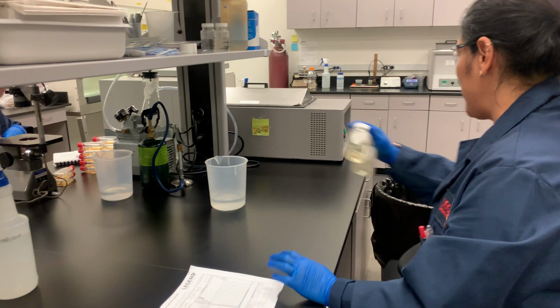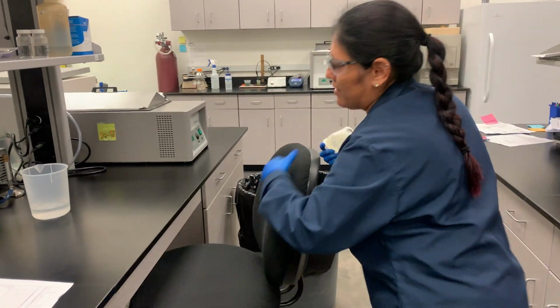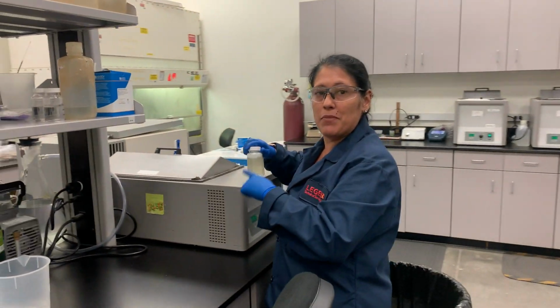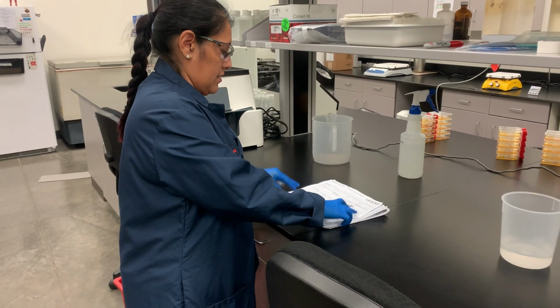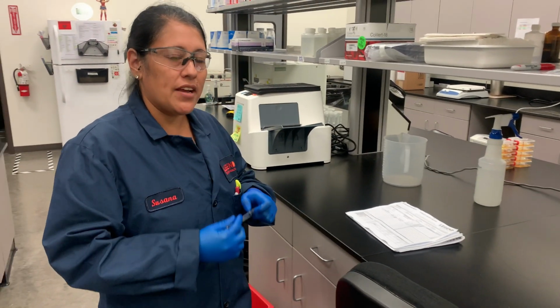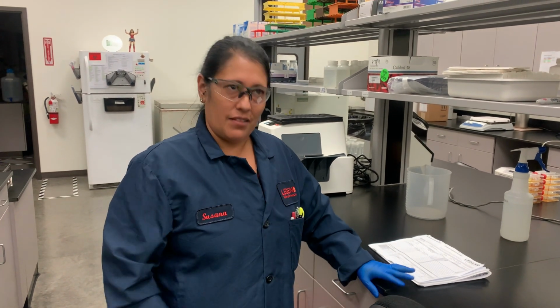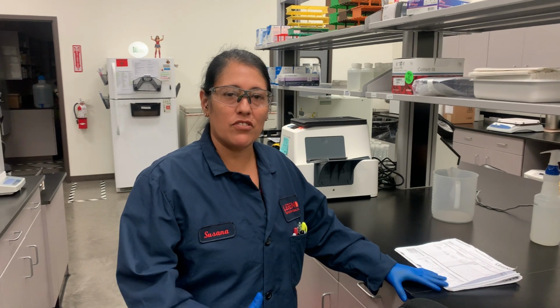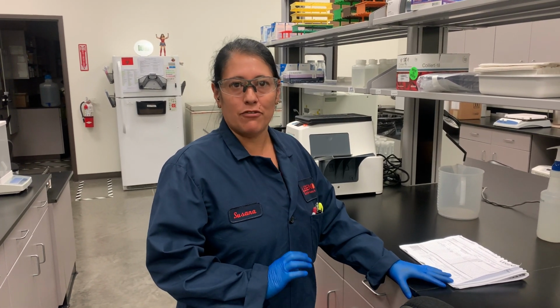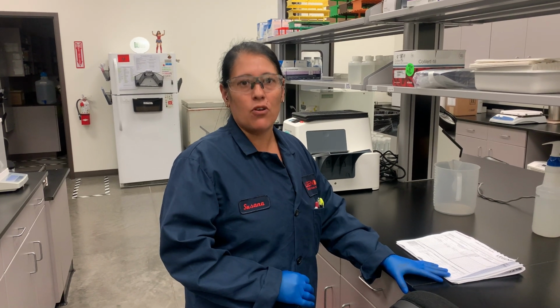And then once we've added the reagent, we'll place it into the water bath, and it'll be in the water bath for 7 minutes before it goes into the incubator. And that's pretty much it. We'll check it after, like I said, 18 to 22 hours. We'll look to see if it's yellow. The yellow will mean that there's total coliform. And then we will check it under the UV lamp to see if it fluoresces, and that will indicate if there's E. coli in the sample.